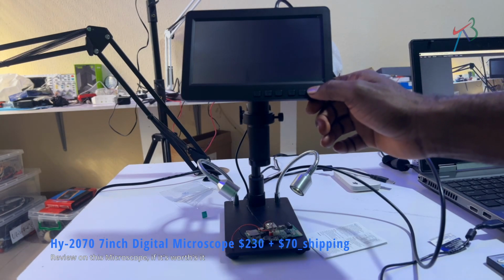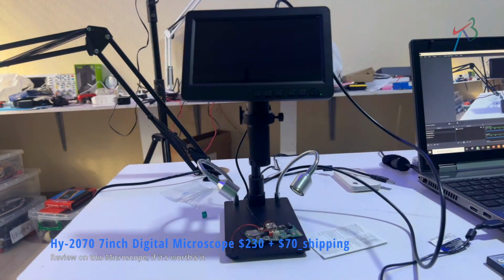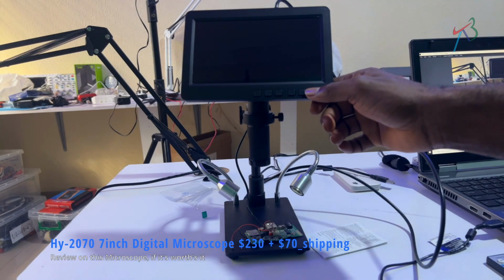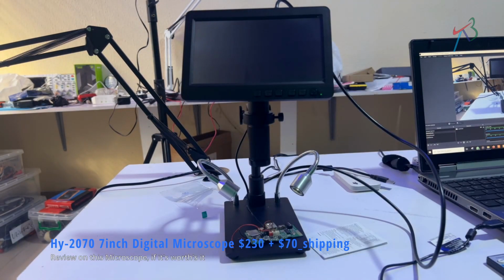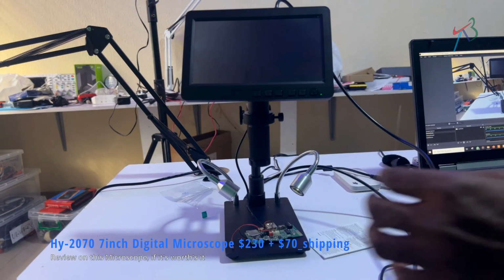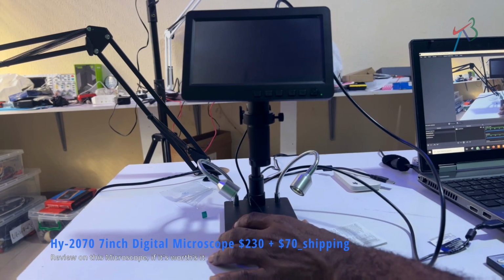You just have to press the button and wait for a while. What I'm going to do now is remove the cover that it comes with. This microscope has two lenses, and I'm just using one of the lenses.